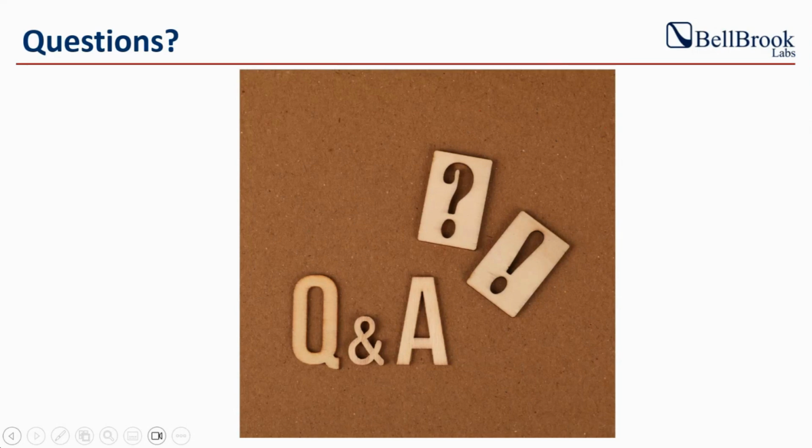Oh, okay, that's a good question. So the idea for the assay system kit is we provide you everything, really from the material to the protocol. So you just need to pick up a protocol. In that protocol, I would already adjust and optimize the antibody concentration to use with the standard condition that we provide. So you really don't have to tune the antibody concentration anymore. But if you want to go away from the standard condition, then you may need to adjust the amount of antibody a little bit to what sensitivity that you want.